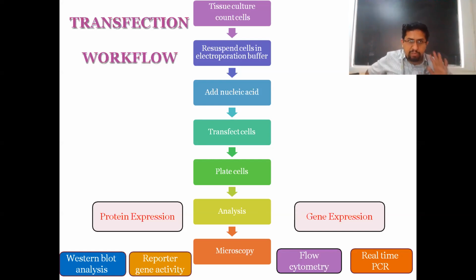This could be asked for a 3-mark question. Describe the methodology used in transfection, or describe the workflow of methodology used in transfection. First, you need to select your cells to be transfected. Let's resuspend them in, I'm sorry, I'll remove this later. This is transfection buffer, or the respective buffer used for transfection.